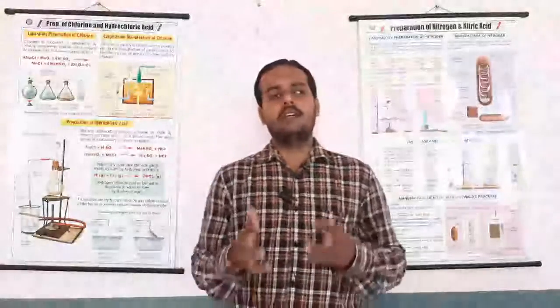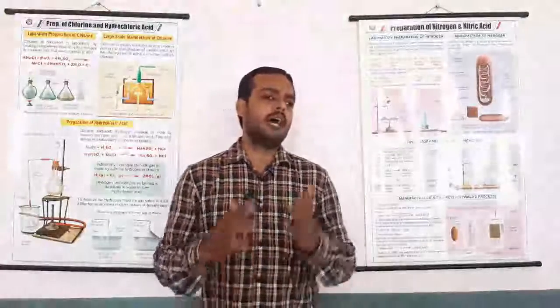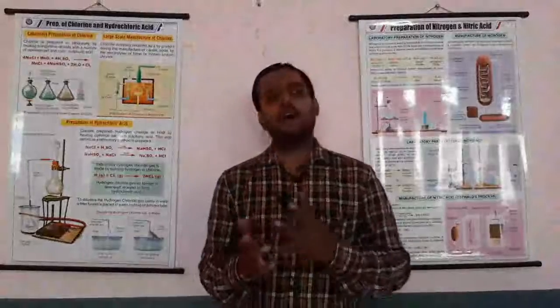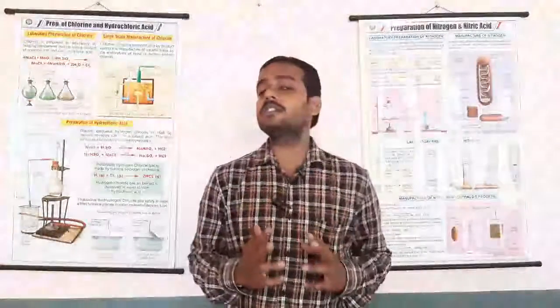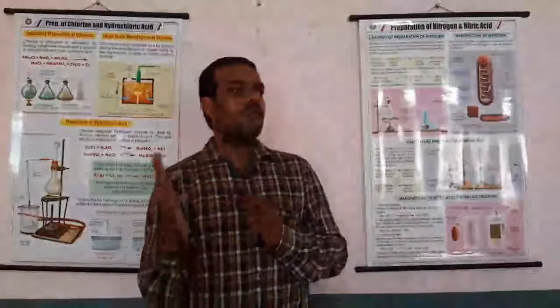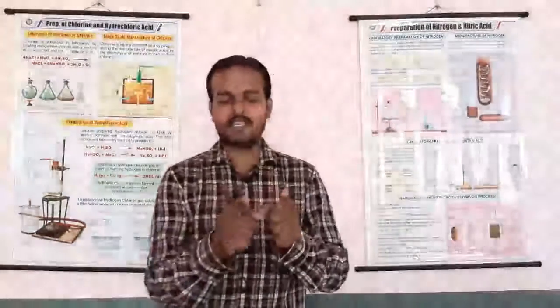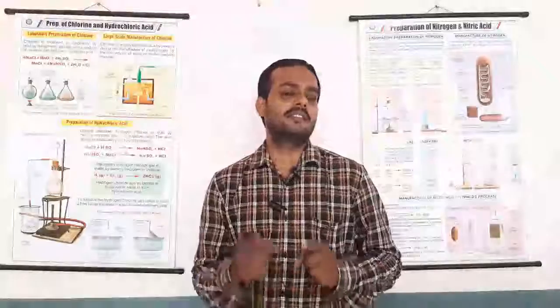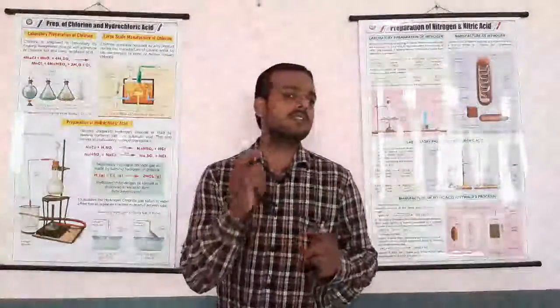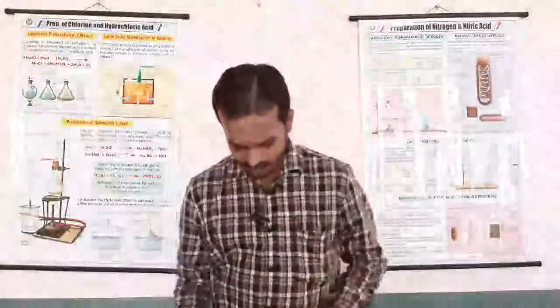So we have done the confirmatory test: acid turns blue litmus red, whereas a base turns red litmus blue.